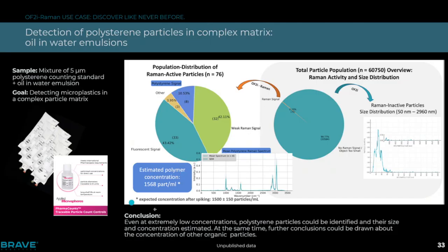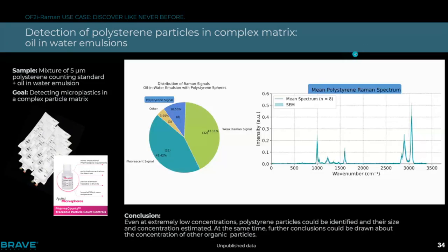And we recalculated the polymer concentration and could see that the recovery rate is, of course, not very statistically relevant within the short minutes, but the recovery rate over time really showed, yes, we can see the particles and find them again, even though lots of other particles, in this case like 30,000 particles, are still there, and we see the ones we actually want to find. We also see other ones.